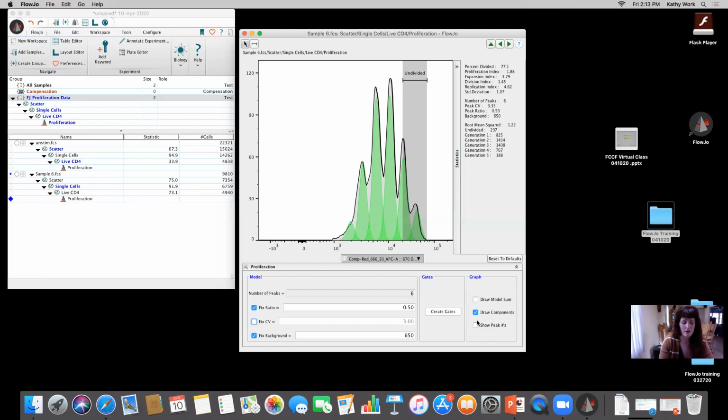Yeah, and the other thing that's important to mention, you want to titrate these dyes too, because as you're doing this, you're optimizing for your assay and for your cells to make sure you're not overloading and causing cytotoxicity. And the other thing we want to be mindful of is that there might be certain scenarios where the cells pump this dye out.